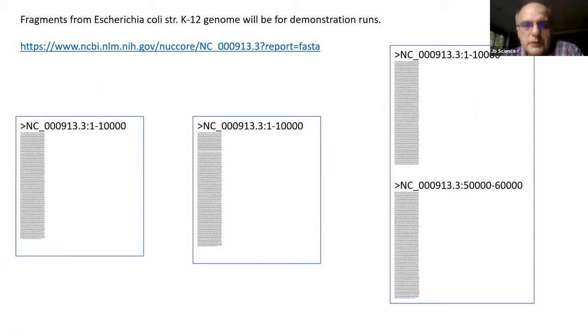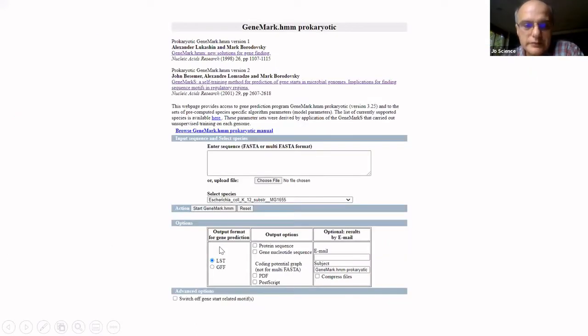And let's move next and take a look now, again, on an example sequence from the E. coli genome. And now, after we discussed in general what kind of input we expect and what kind of output, we're getting back to the GeneMark HMM gene prediction program. So we have a sequence, we know how the output looks like.